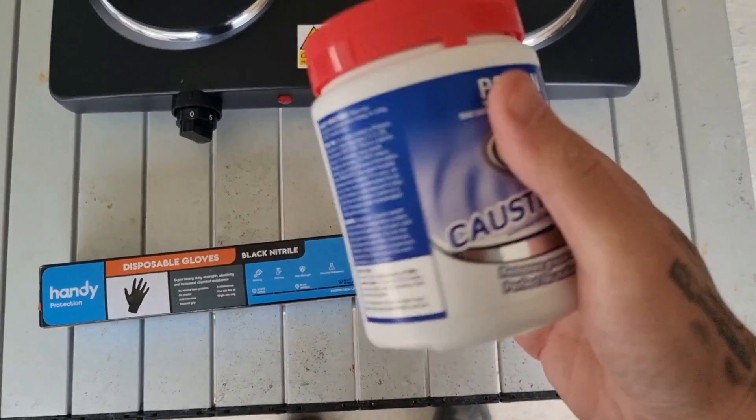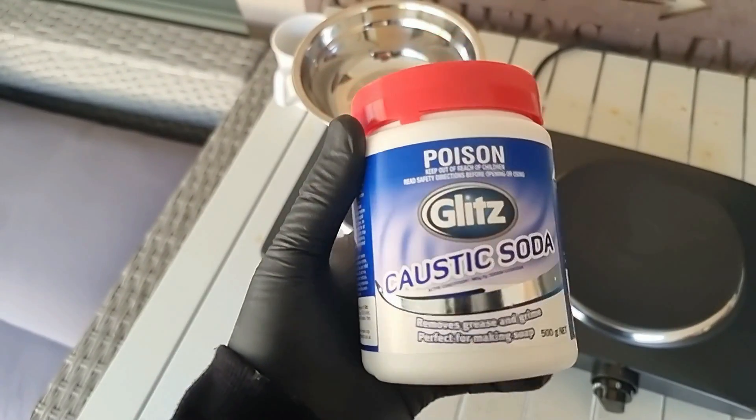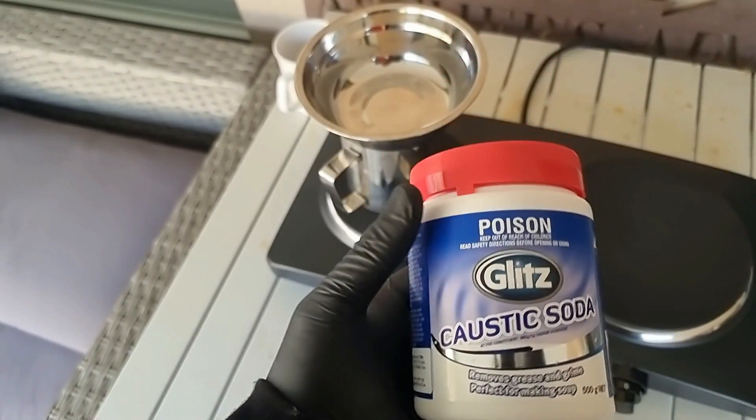Or you could use hydrofluoric acid — an incredibly dangerous acid and hard to get. Or like today, you could use caustic soda, which, whilst dangerous, is nowhere near as dangerous as most of the other options. I say dangerous, but I really mean hazardous. We're going to boil the quartz in liquid caustic soda.